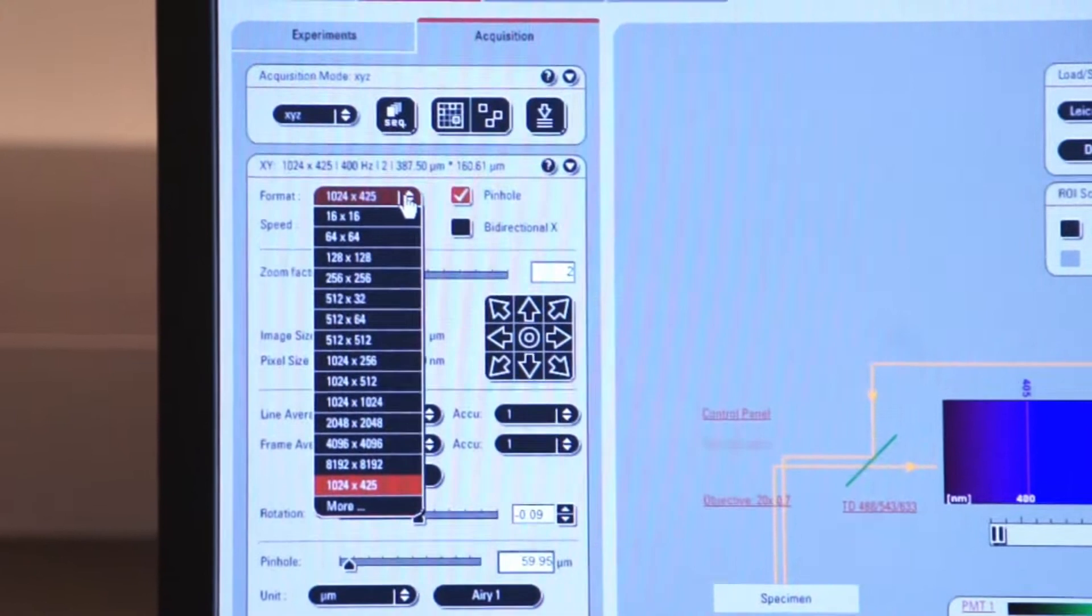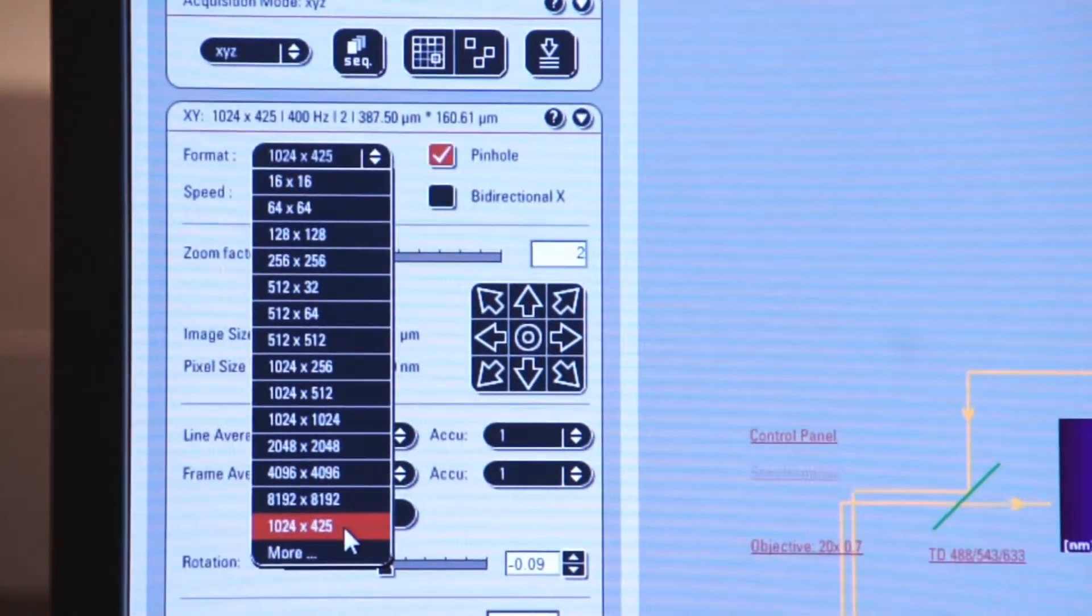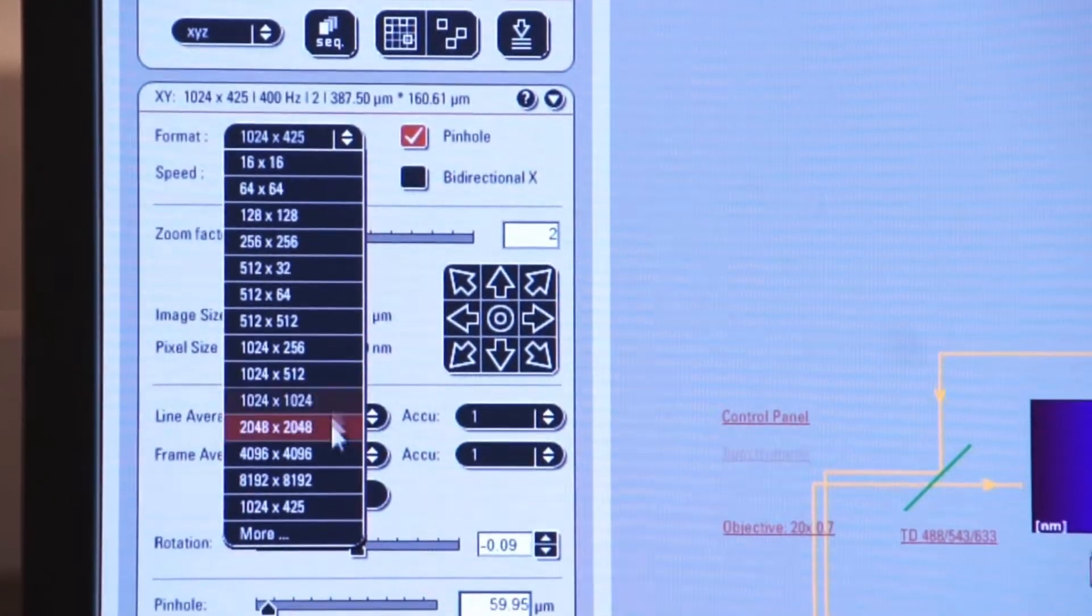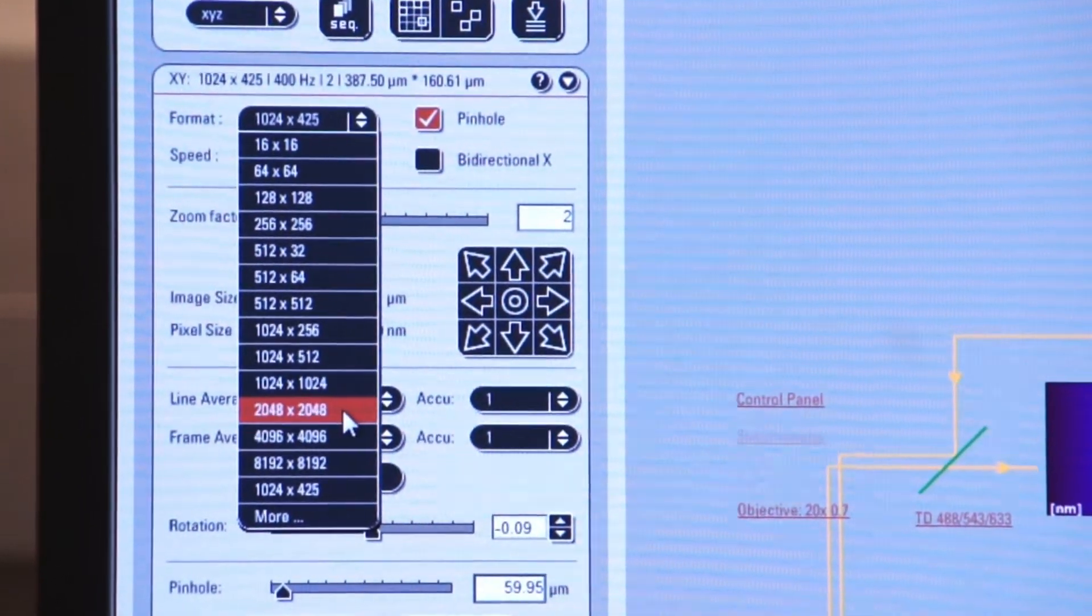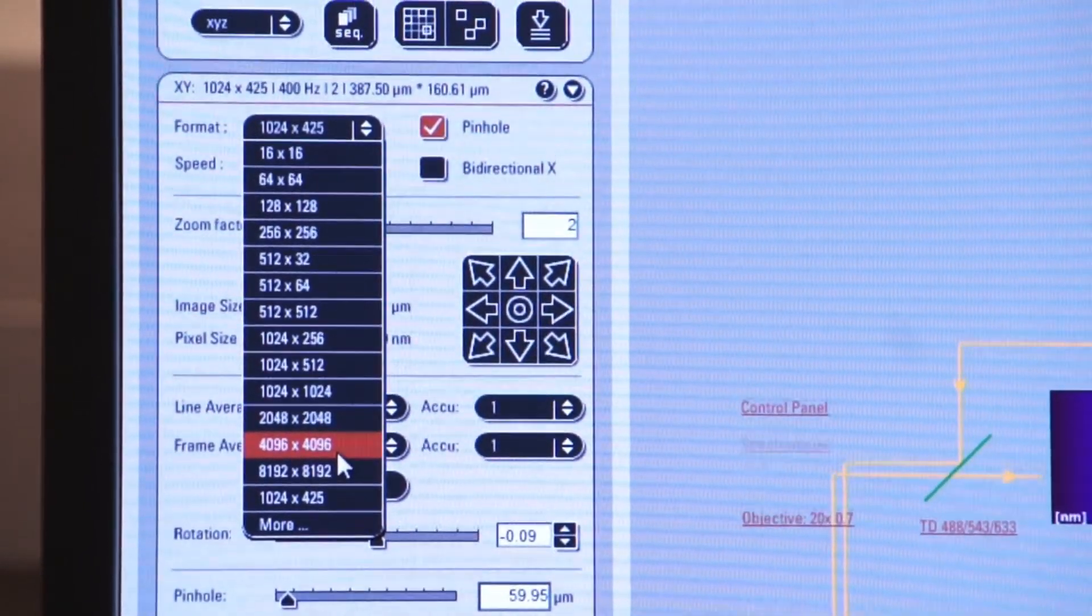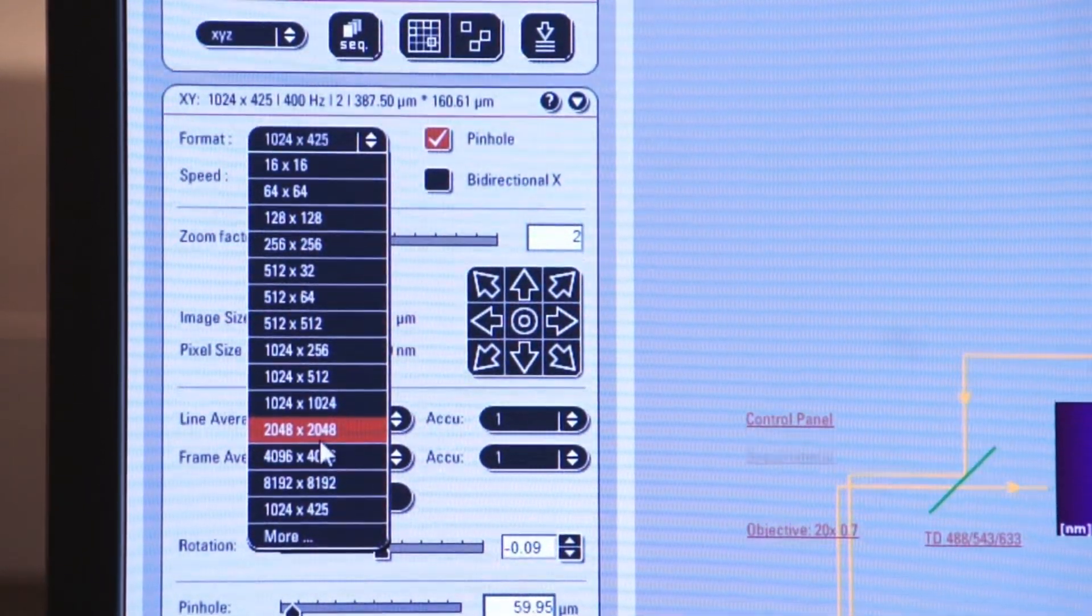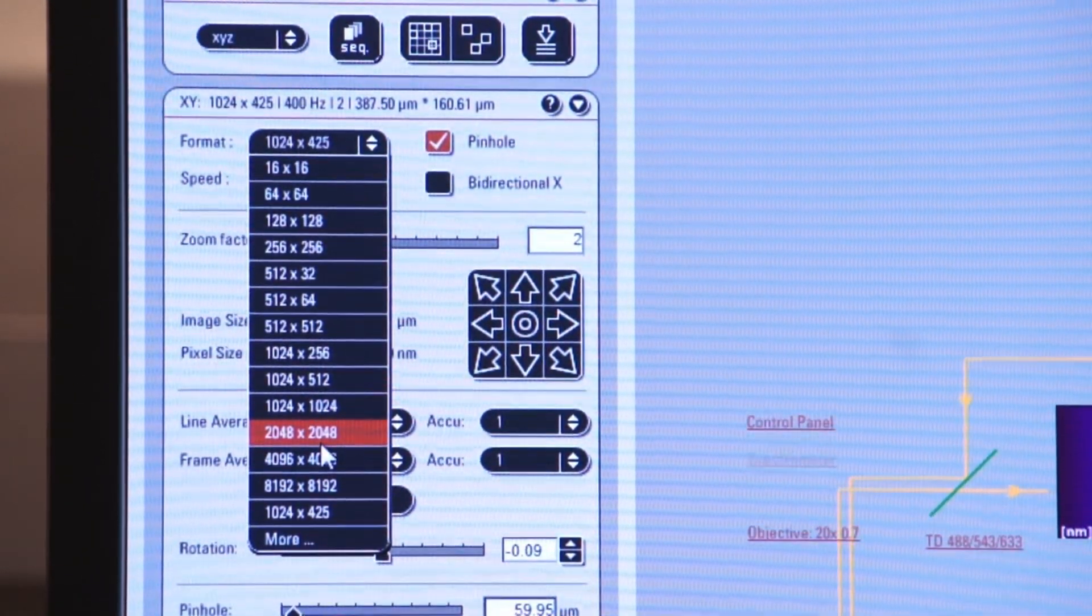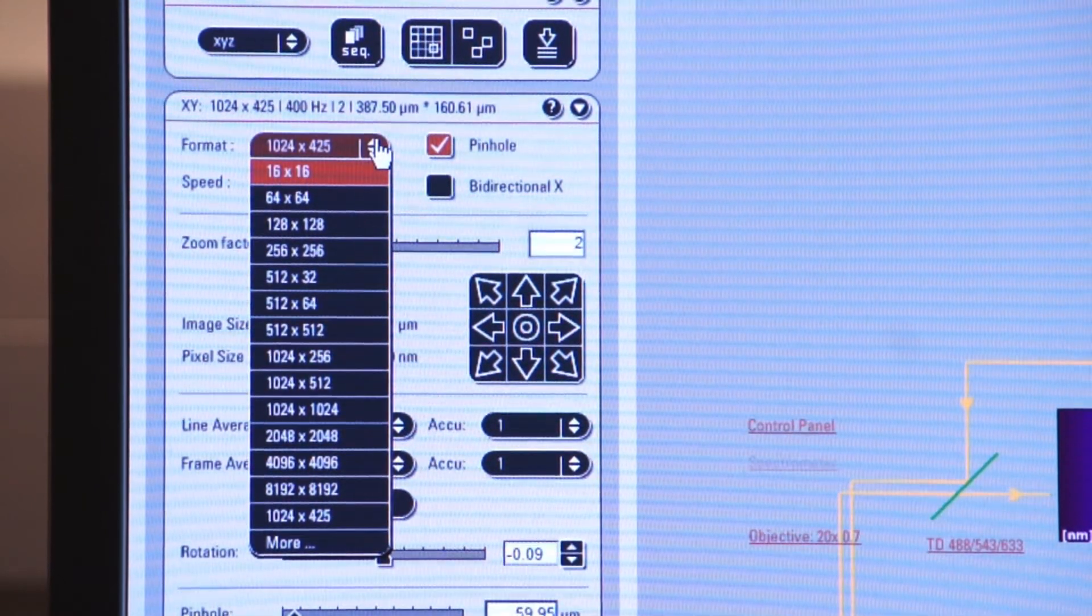In a few minutes, we will go back and select some very high resolution images, and we will do line averaging and frame averaging to get better images from these resolutions. So we'll come back to that in a second.